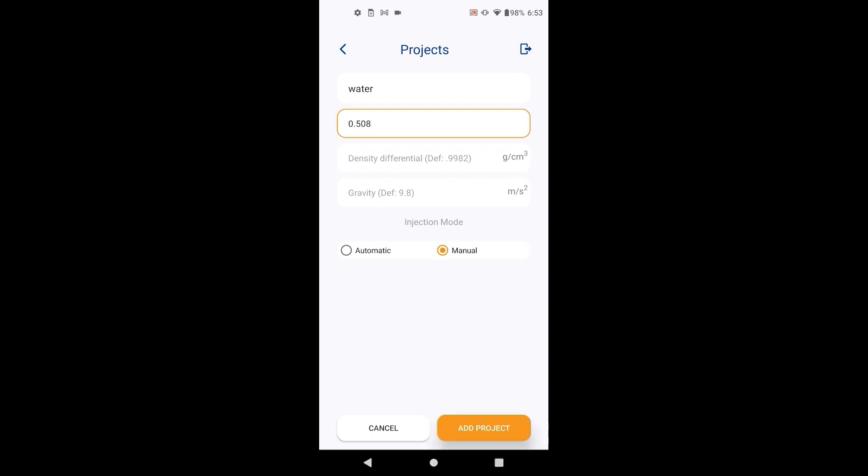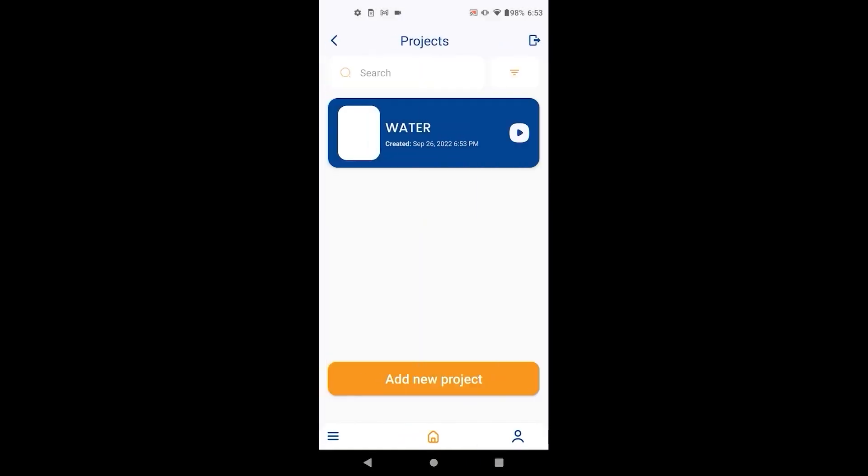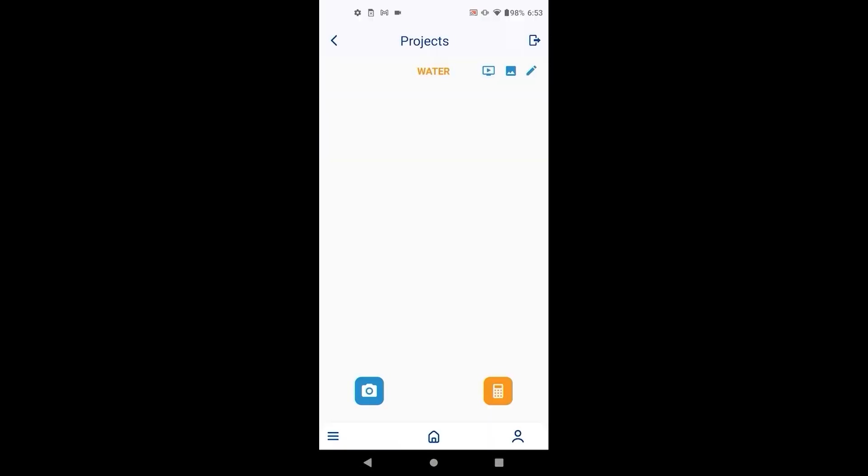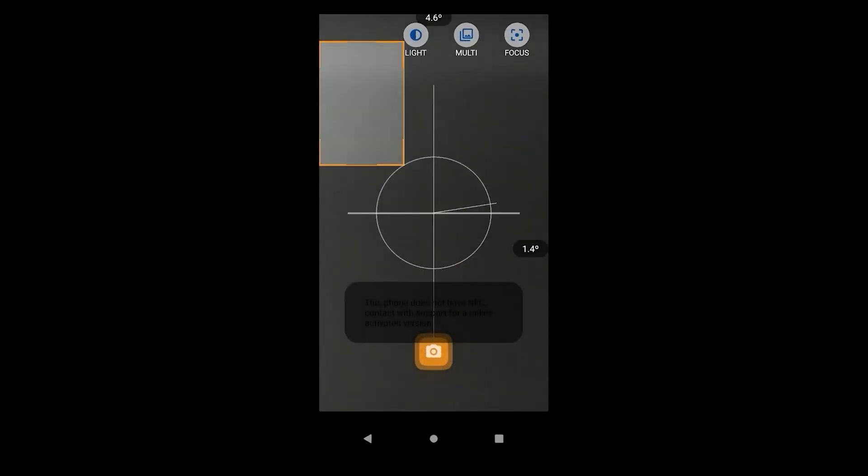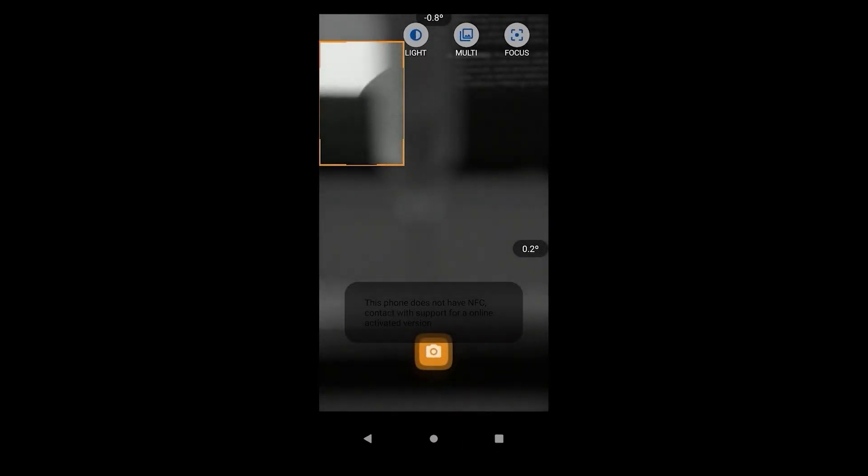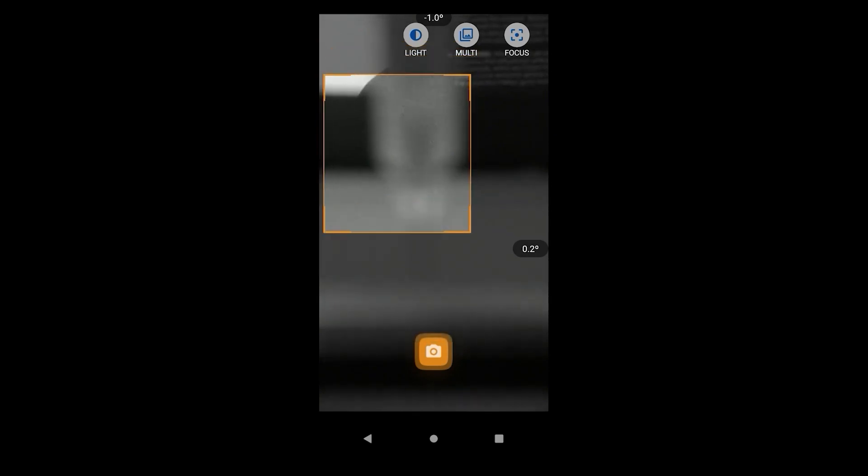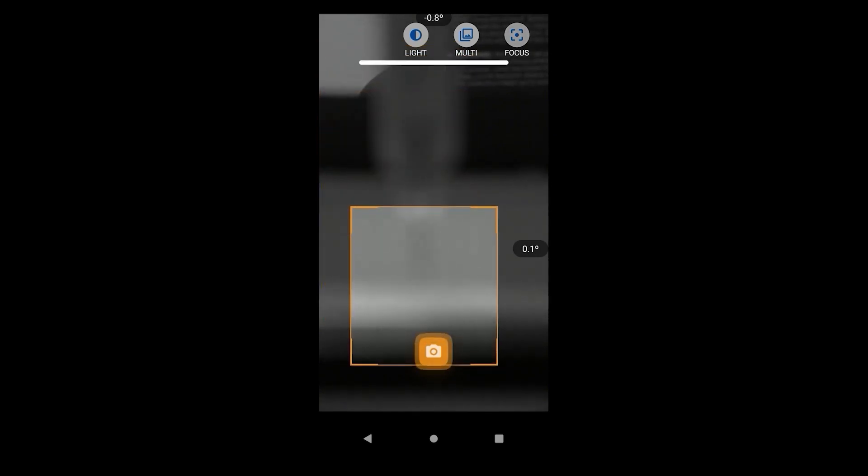Click on the newly created project and enter the image capture screen. Now put the phone inside the phone holder, click on the blue image capture button and adjust the distance from the needle.